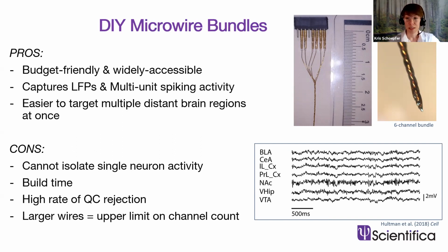There are some downsides though. However, of course, you cannot isolate single neuron activity this way. You can, of course, get the multi-unit activity like we discussed earlier, but I'll mention tetrodes in just a moment, where we can isolate single unit spiking.